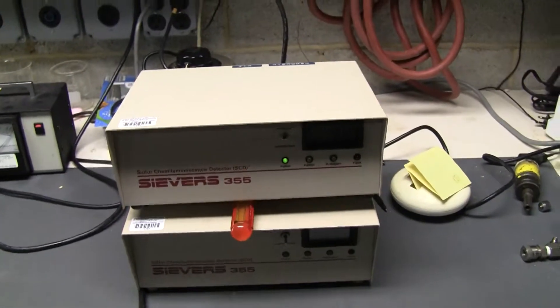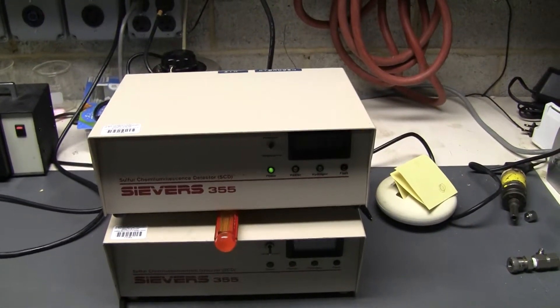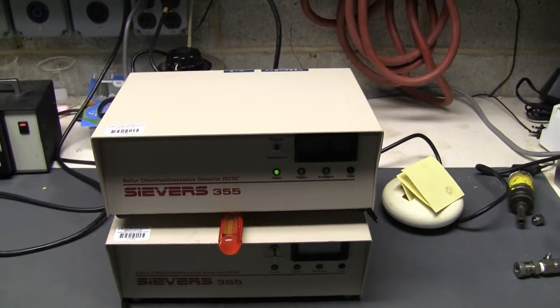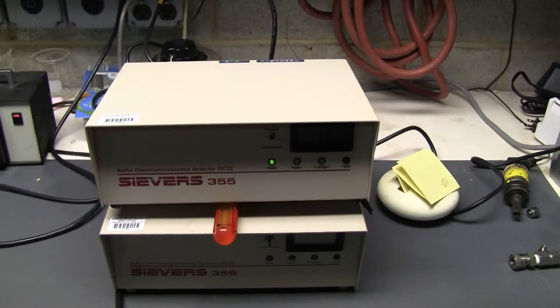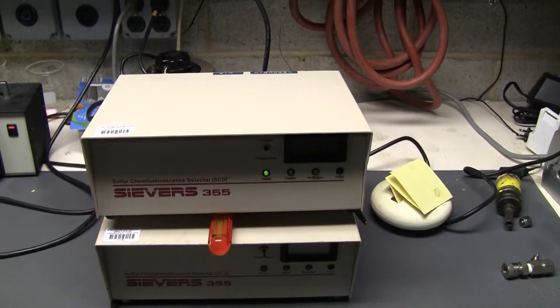Hi, this is Michael from Hitech Trader. Today we're looking at a sulfur chemiluminescence detector. This is the output controller for it. It's a model 355.